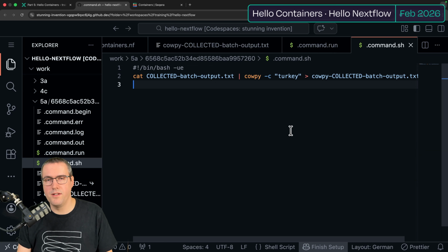And so you can see that Nextflow is taking the workflow logic, which is the stuff that we actually care about, which is specific to our analysis, and it's doing all the clever behind the scenes stuff to make Docker work on our system. And it's doing that in a really portable way so that an end user of the pipeline can switch out the technology they're using. Docker, Singularity, Apptainer, Conda, but it doesn't really matter to the pipeline logic, and Nextflow will handle all the underlying infrastructure needs so that it runs anywhere. And that is really the superpower of Nextflow, is reproducibility and portability.